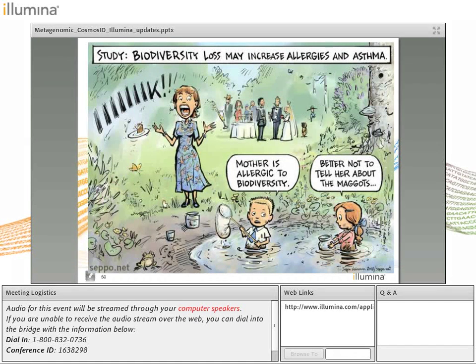So our current app in BaseSpace is only for bacteria. It has about 4,700 bacterial strains. And internally, we're working on expanding that. I think our next database will have around 31,000 strains. But currently in BaseSpace, we only have the bacterial database. In-house, we have other databases, such as fungal and parasite and DNA viruses, but that's not yet deployed to BaseSpace.